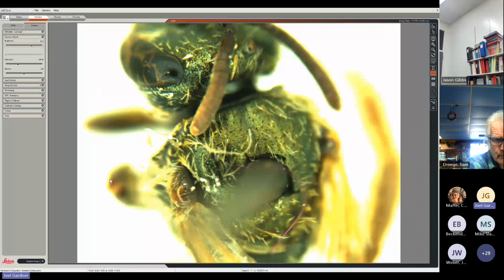All right, so here's a versatum. Actually, the colors are a little bit off, but you can definitely see in the middle of the scutum here, there's this really dull kind of imbricate microsculpture, and it's just as dull in the middle as it is up in this anterior region, so it's really uniformly dull.